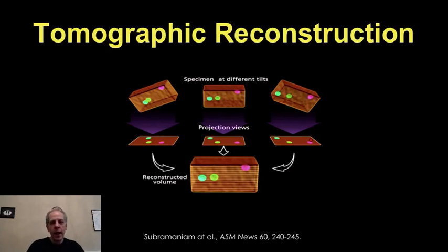So you throw in a few and then you put them together, and that helps you to stack the images and to basically get the 3D in the computer of the real three-dimensional virus.